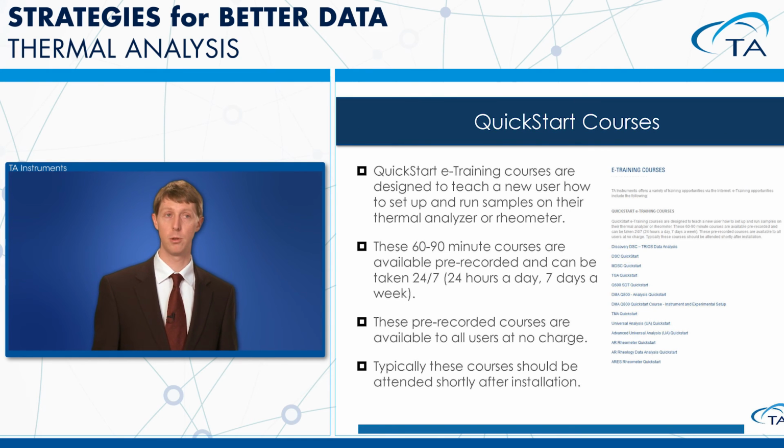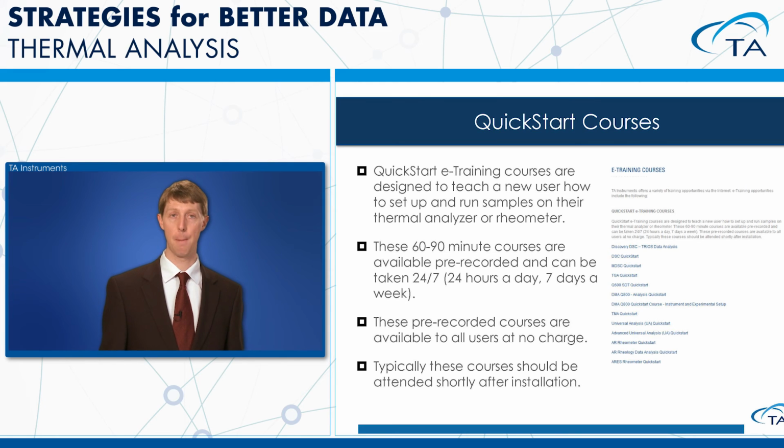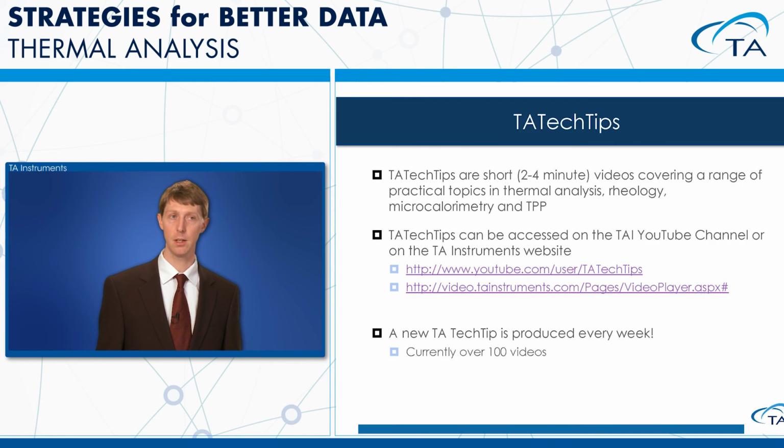On the website, there are also quick start courses that can guide you through different facets of data analysis, of data collection, how to use Universal Analysis, how to use TRIOS. That gives you a much more in-depth instruction over what we've covered in this particular training session. And again, I'll mention the TA Tech Tips. They're quick videos that give you tips on how to do small tasks. And hopefully it's just a small question here and there that you're having trouble with, and the tech tip will get you going into the next phase, whether it be sample loading, pan loading. So these are relatively quick, but they're extremely powerful and very helpful.